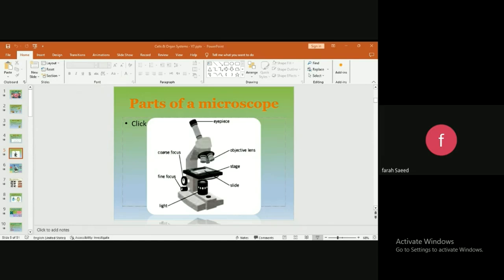How will you be able to see the specimen? There must be a source of light that shines on the specimen from underneath. This is why here we have a lamp—this is your source of light. When you connect the microscope to the electric supply, the lamp will turn on and produce light or shine light on the specimen.